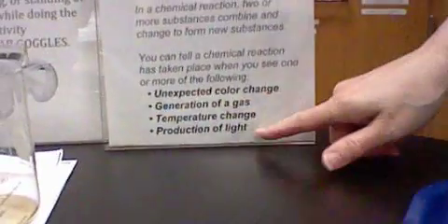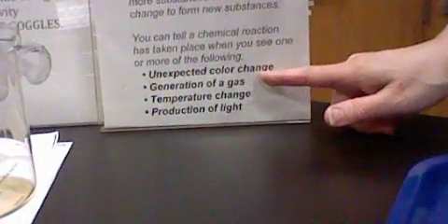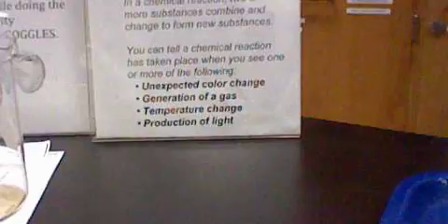And what happened? Which one of our things happened? We have a color change, right? Producing of light. Do we have any bubbles? Yeah, a little bubble, so we have produced a little gas. And let me put it in here. It glows a bit. Oh yeah, it glows. Can everybody see? Yeah. I think so. This is what they put in glow sticks.